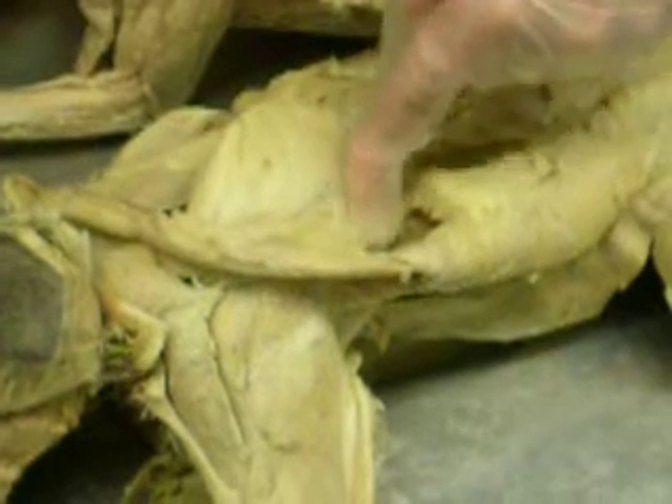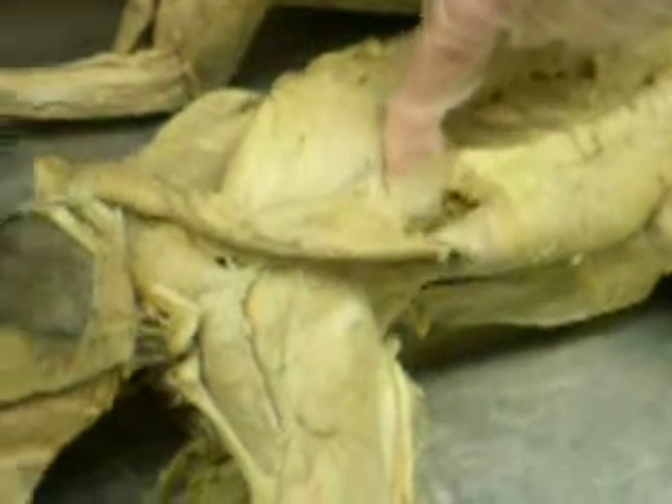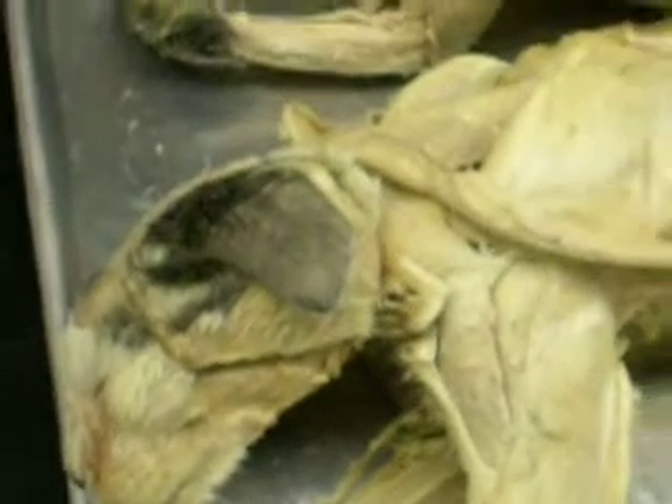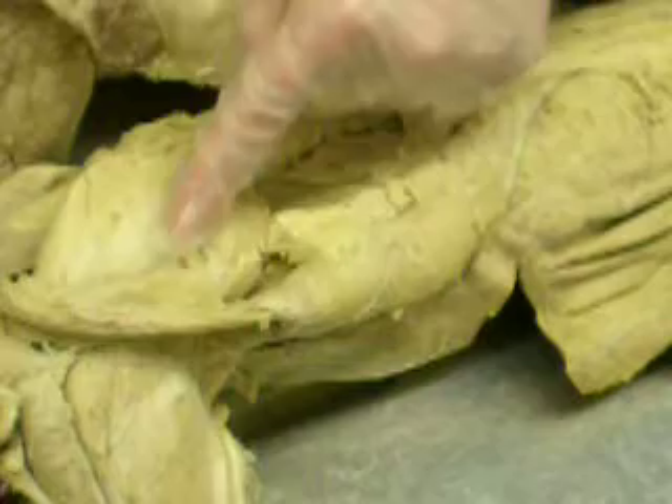The muscle below the spine of the scapula is called the infraspinatus. Where's the spine again? It's in the middle — that's the spine, that's the blade of the scapula. Where's the spine? The subscapula — it's the shoulder blade, it's right in the middle.